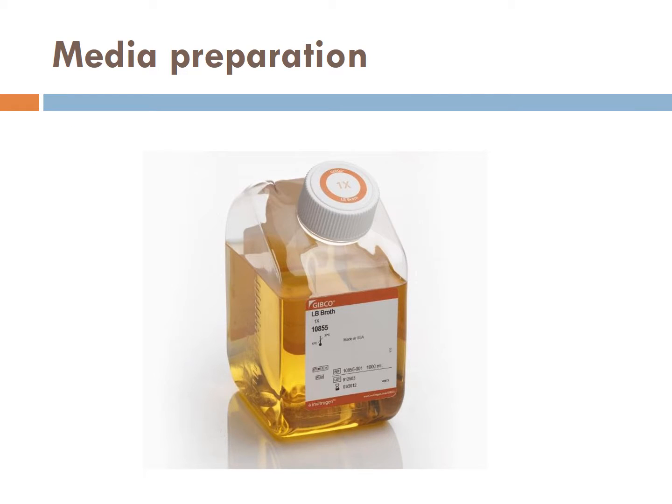For aerobic microbiology, preparing media is a trivial exercise. You combine components together, bring them up to volume with water, and autoclave to sterilize. If that seems like too much work, you can even buy media pre-made. This is 1x LB broth. Simply pour and use.